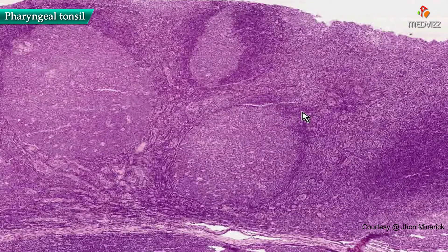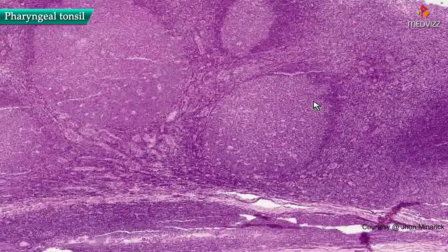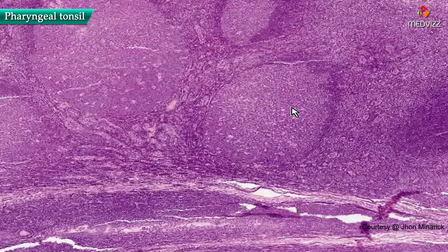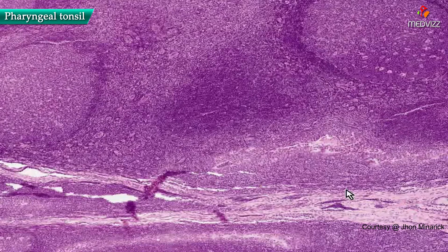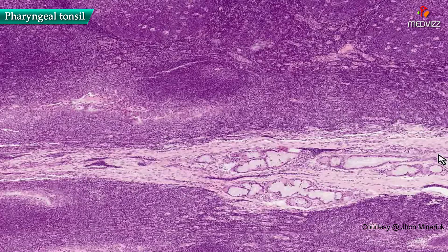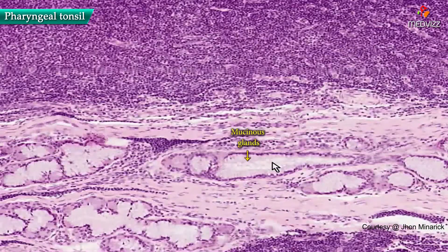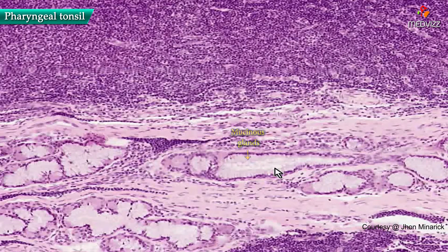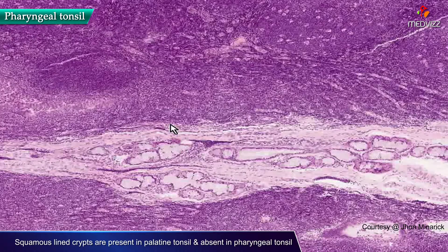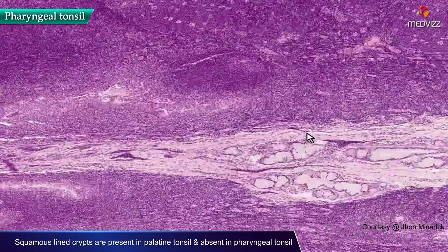We know that it's not a lymph node because you don't have organization into capsules and medullary areas. So we suspect it's probably some sort of mucosal-associated lymphoid tissue, and because you have some glands here which look mucinous — typical of the oral cavity or upper respiratory tract — we suspect these are tonsils. And we know that they are not palatine tonsils because they don't have squamous-lined crypts.